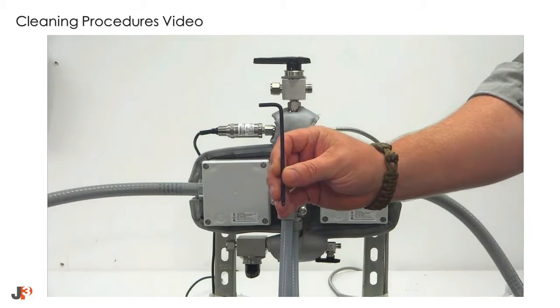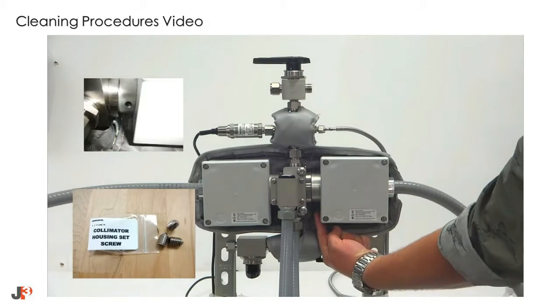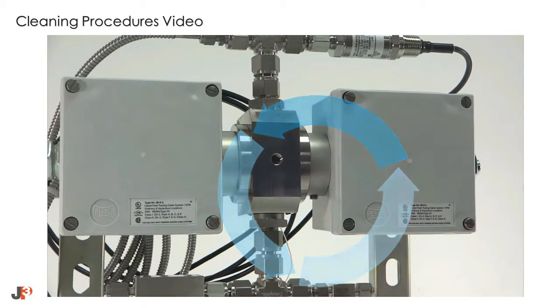Using a 5/32-inch hex or Allen key, loosen the collimator housing mount set screw. Be careful not to remove it. However, should you lose it, additional ones are included in the cleaning kit.